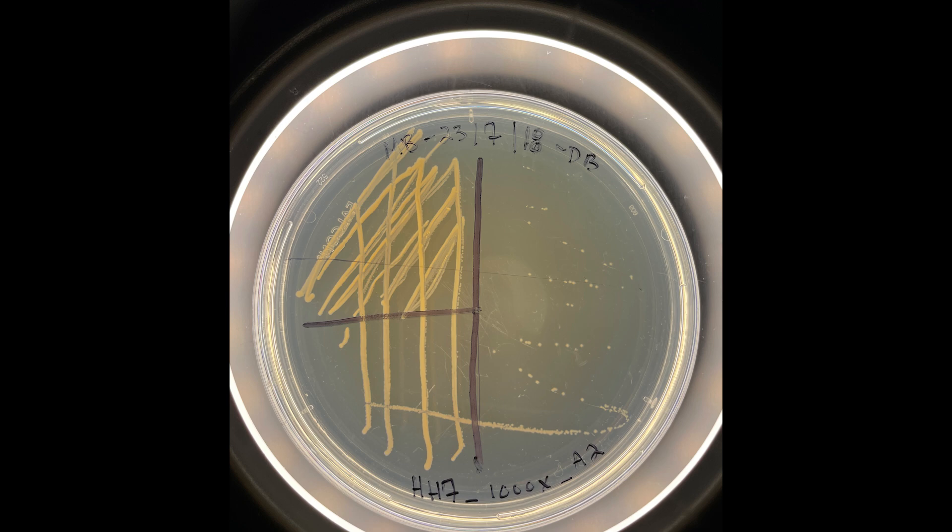So here you can see what that T-streak plate looks like after 24 hours. It's not as cute as the first plate, but it does get the job done. And you do have isolated streaks at the end.